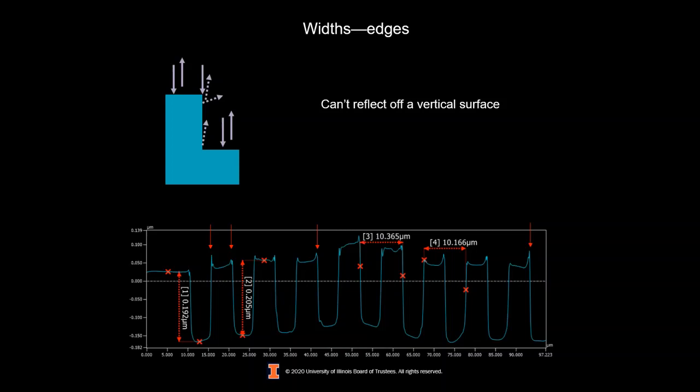Okay. Here's a question. Can you comment about challenges for measuring the surface of a large transparent sample where the sample is several millimeters thick? What would be the challenges for that?